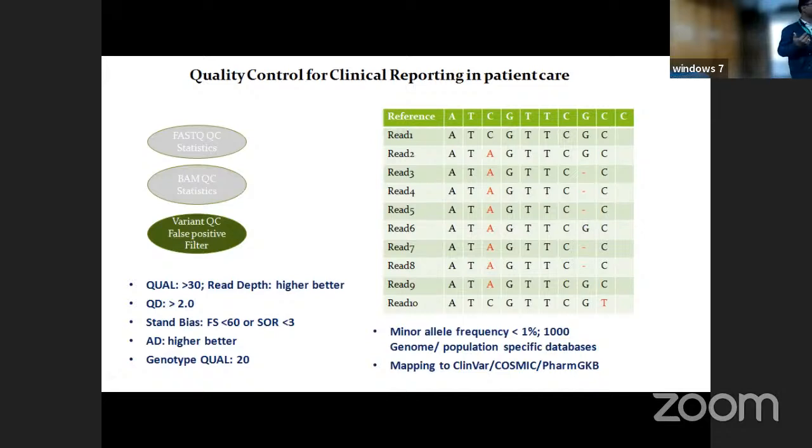The human genome is diploid. So it might happen that if a variant is heterozygous, it should be present in less than 50% of the reads. Technically, if something is present in more than 50% of the reads, it is a homozygous variant. As simple as that. Homozygous variants are more likely coming from the parents. Heterozygous might be somatic, or may not be somatic, because often it might come from a single parent. Okay, that has to be validated later on.